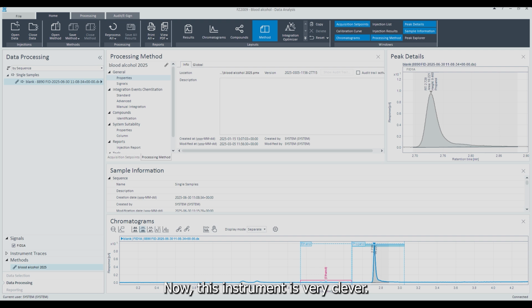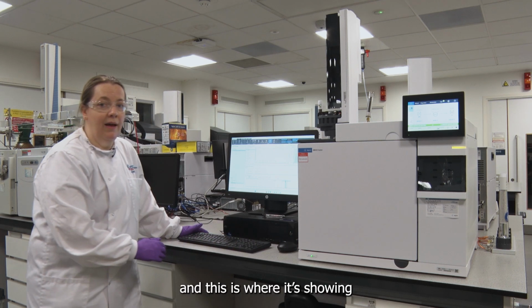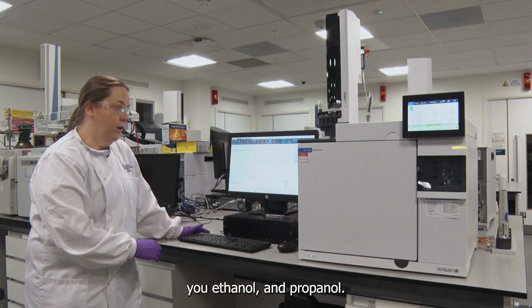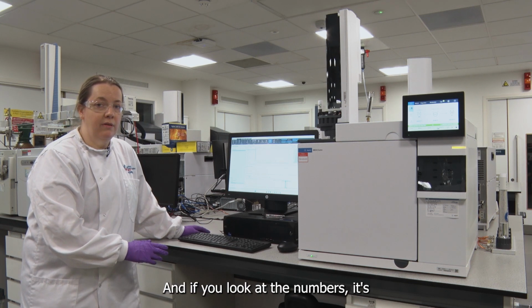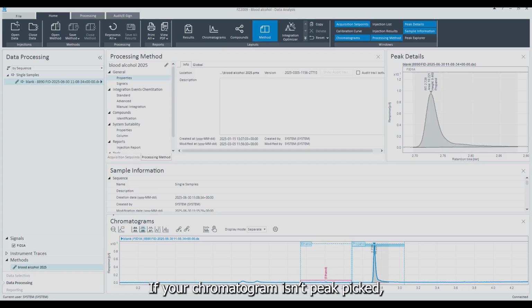Now, this instrument is very clever. It identifies ethanol and propanol for you, and it peak picks it, and it will tell you the retention time and the peak area. So on the software at the bottom, this is the chromatogram, and this is where it's showing you ethanol and propanol. And if you look at the numbers, it's telling you the retention time and the peak area, and these are what you need to record. If your chromatogram isn't peak picked, ask me or the demonstrator or one of the technicians, and we can peak pick it for you to give you the area.